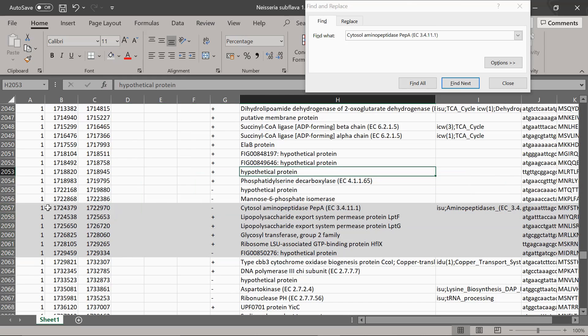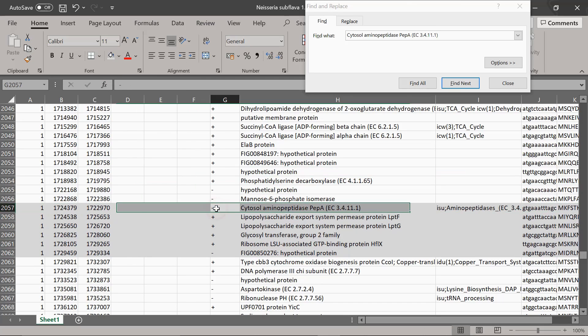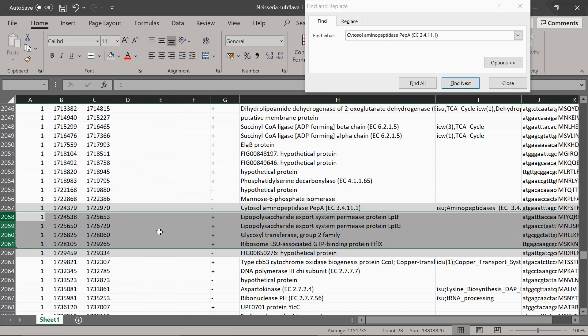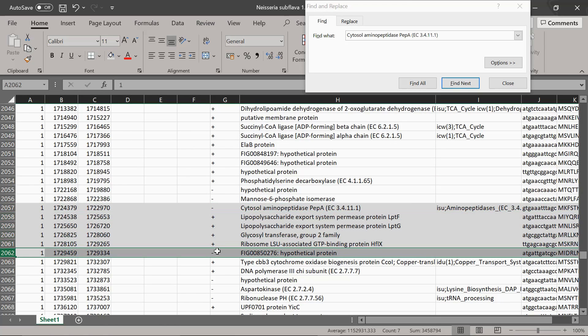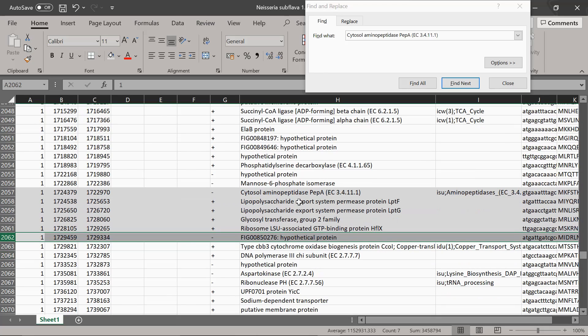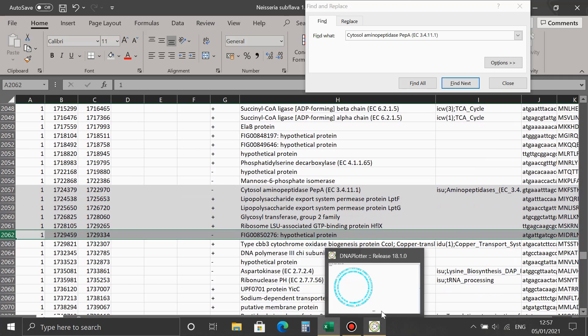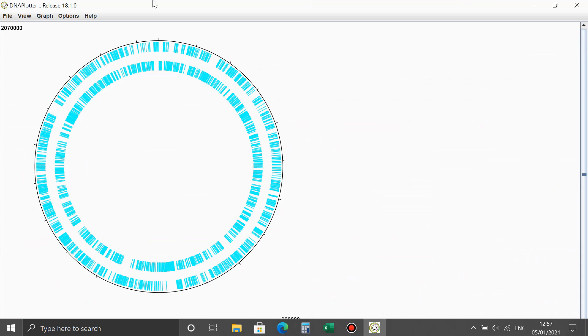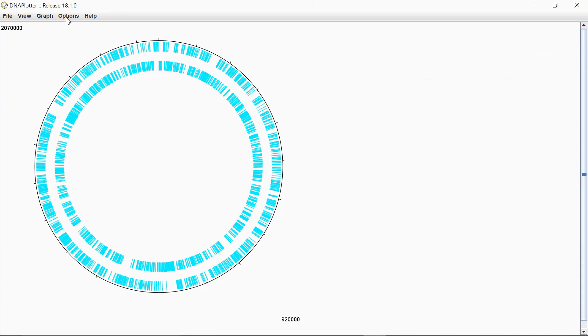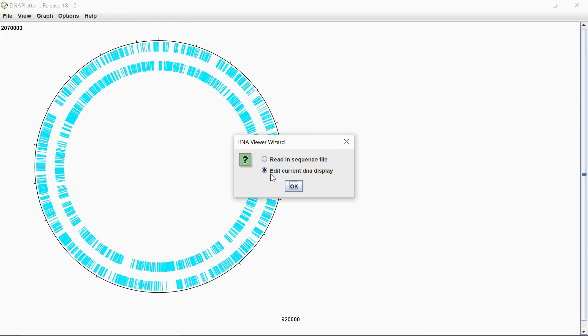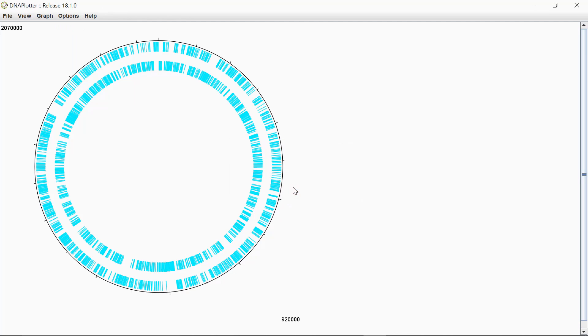So what you can see is you've got this first gene is on the reverse strand. And then you have a cluster of genes here from the opposite strand and here reverse. So I'm going to see what that looks like when I actually put that into the DNA plot tool. If I open up DNA plotter again, if I go on options, for this you want DNA wizard. And then it asks you edit current DNA display, press OK.